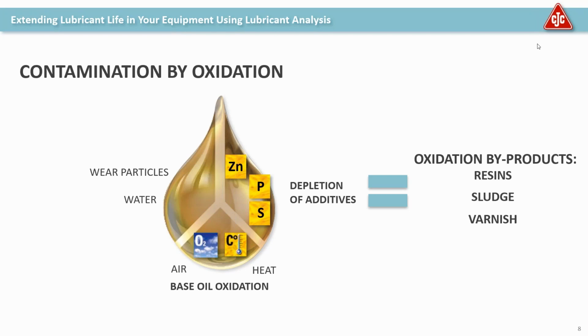So particle count is definitely a good start. It helps you start to see a trend, whether it's up or down, right? And I think the other tests really help come into play because while particle count gives you a trend, they really are the supporting evidence for what else might be going on.